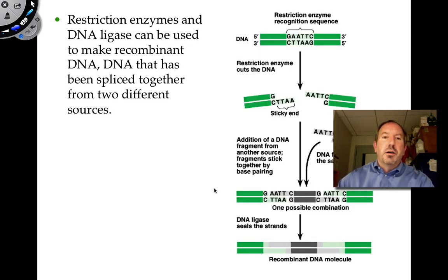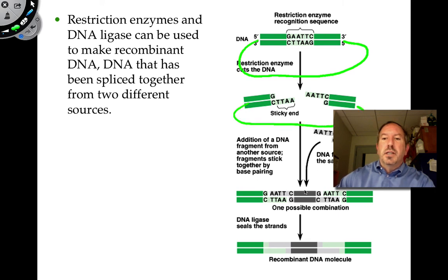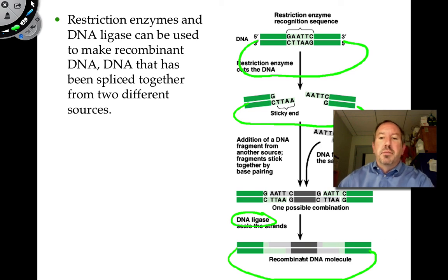And so here's an overall diagram of this process. Here's the plasmid, although it doesn't quite look like it. Let me see if I can help that. The plasmid would be a ring. We cut it with the restriction enzyme. It opens up like this. And then this area in black, let's just say that this is our Redwood gene that we amplified. We're going to put it in, and then how do you get it to attach? DNA ligase. So we ligate it in. So here's our little rubber band with Redwood DNA in it. Pretty incredible.